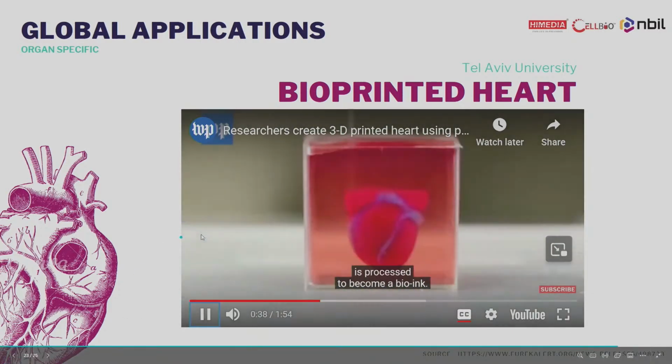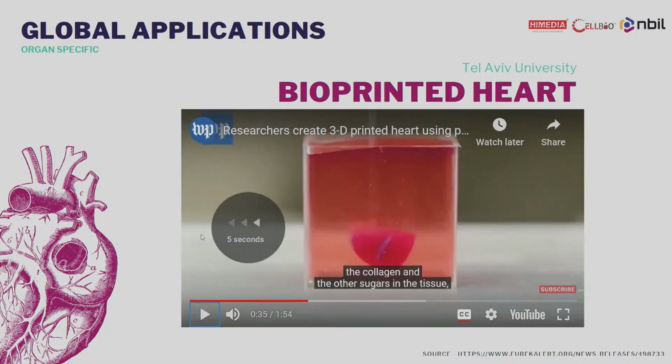this is how the printing is happening. So this is a container which will have the biomaterial already in it, and the extruder will have a biomaterial type 2, suppose, which is a cross-linker kind of thing. Now, you are printing the cross-linker directly into the vessel, which already has a bioactive material. As soon as the cross-linker comes in contact with the respective biomaterial, suppose out here it is sodium alginate and calcium chloride. They cross-link well, right?